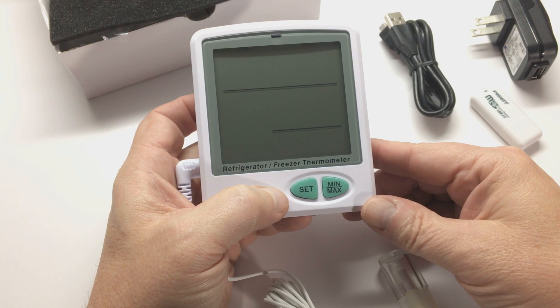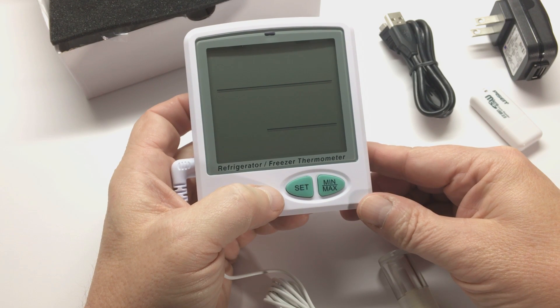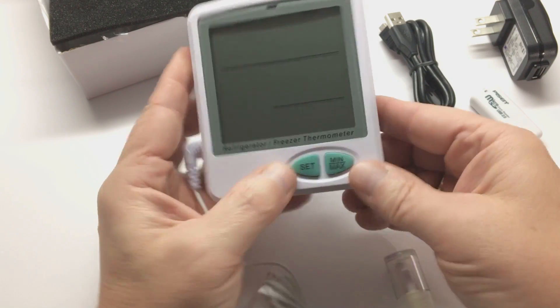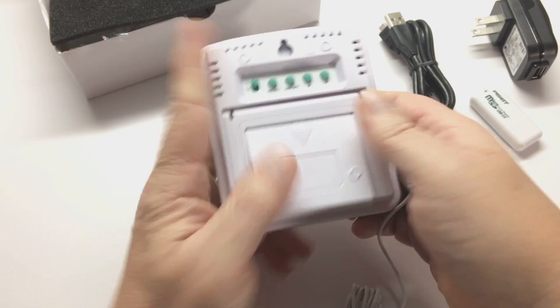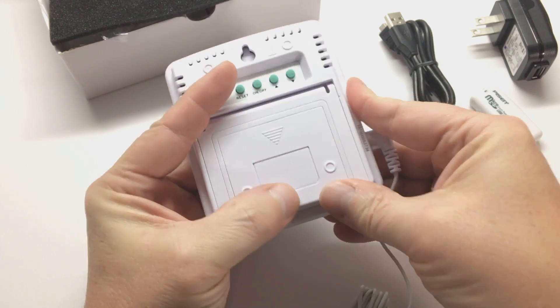Welcome to this instructional video for Thermco's model ACC RT8002 Temperature Data Logger. Turn the unit over, open the battery cover, remove the insulating strip, and the unit is now powered on.